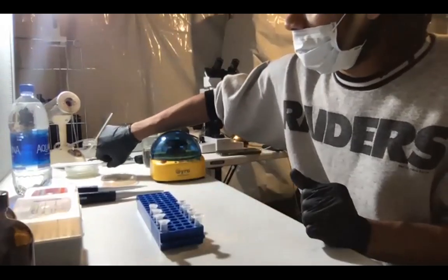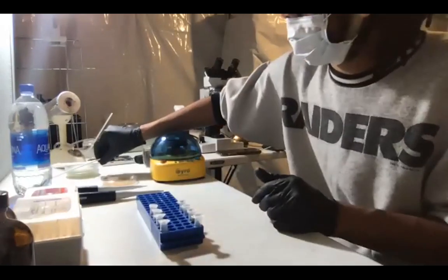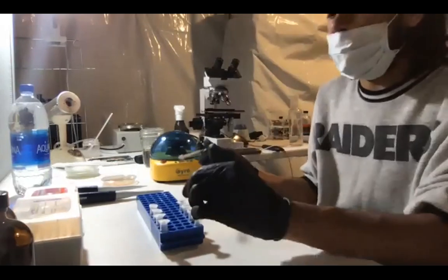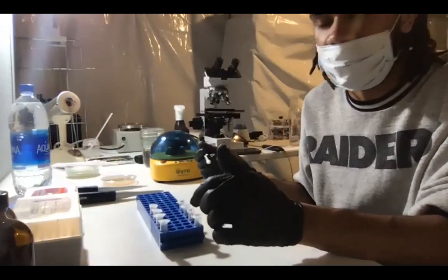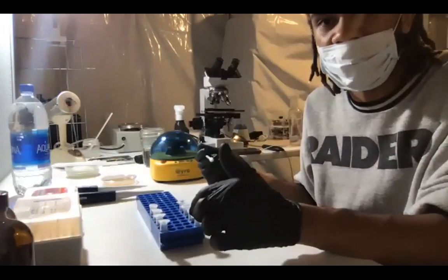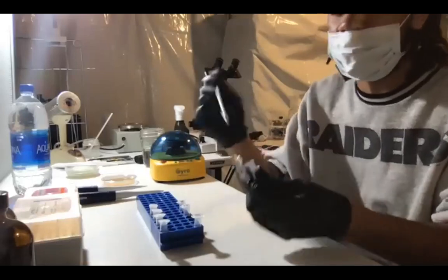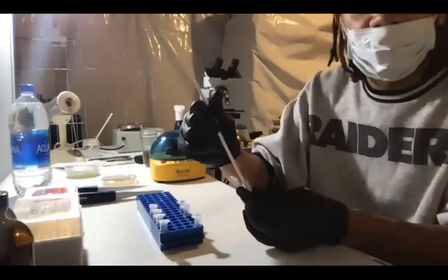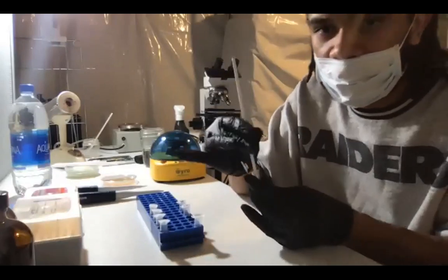After you extract your DNA into the tube, heating it up to 95 degrees Celsius for 10 minutes can increase your success rate of this process by up to 20%. It's not necessary, but a 20% increase of success is a really good increase, especially when you just do this sometimes and it doesn't work at all.